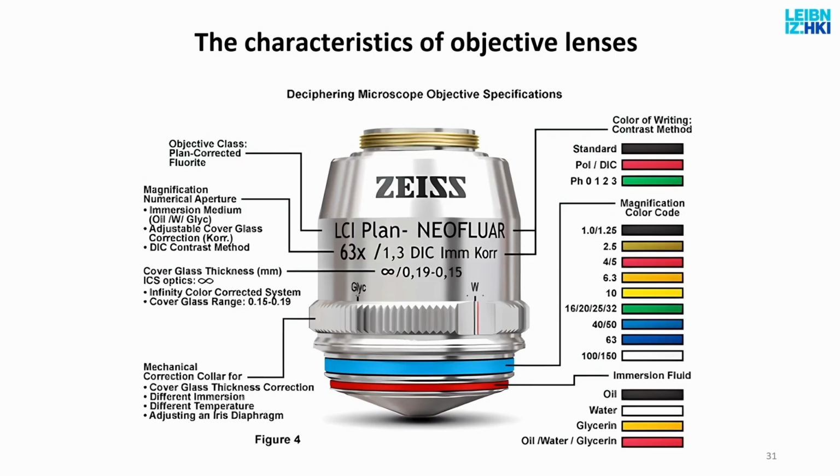So if you're working with a petri dish, not with a cover slip on a microscope slide, the bottom of the petri dish will become the cover slip. And that cover slip, the bottom of the dish, can only be in this thickness range. So you cannot use a plastic bottom dish. When you order your petri dishes, you have to make sure that it's covered with proper glass with the thickness of, typically what I get from biologist colleagues, number 1.5, which is 170 micrometers.